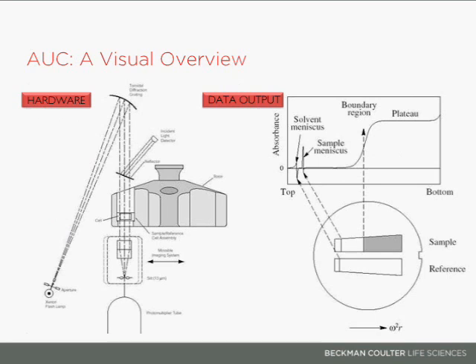On a macroscopic level, you can think about it as putting sand in a glass of water, shaking it up, and watching the sand particles slowly sediment down. The sand particles that started at the top of the glass, I should say, are the ones that you're observing at the top throughout. So the boundary region really gives an indication of how quickly the particles at the top of the cell have now sedimented to this location. And this is how you derive the sedimentation rate.